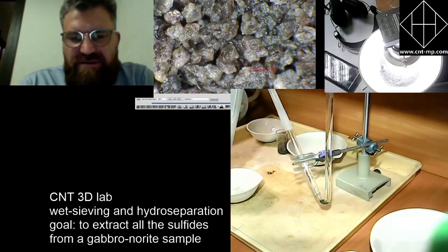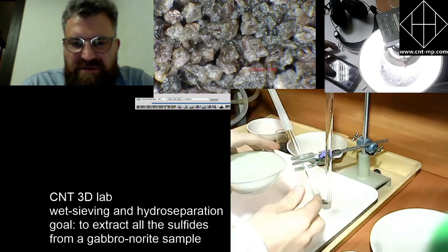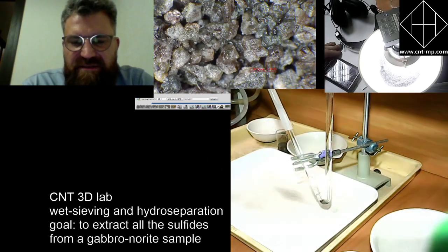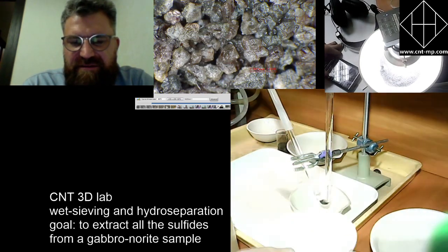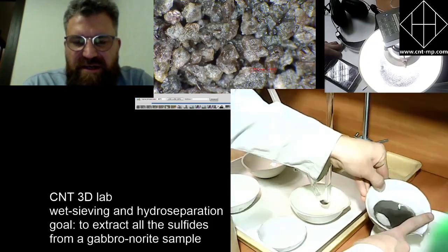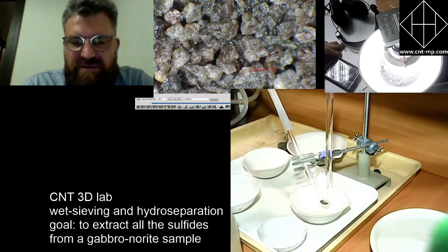And it is a very interesting process as well. Guys like to use this process because it's really like playing with sand and water, and always monitor grains under the microscope. It's more or less like a miracle when you see grains that you cannot see in the primary fraction, and then they appear in the very final concentrate.